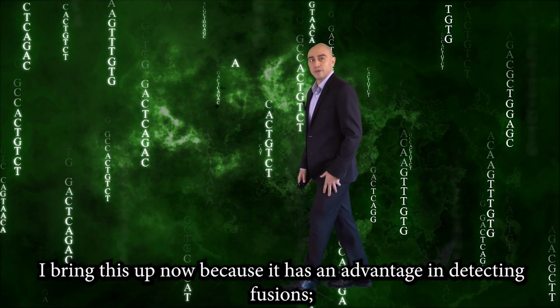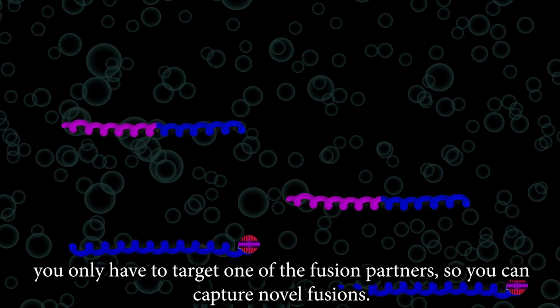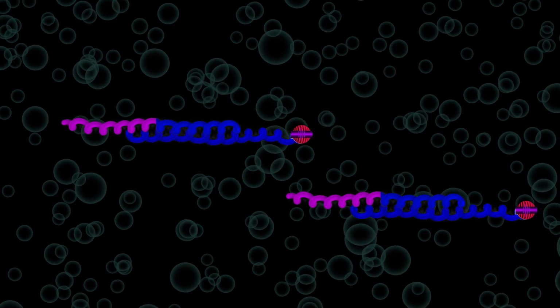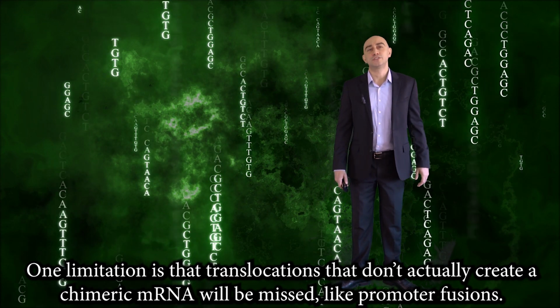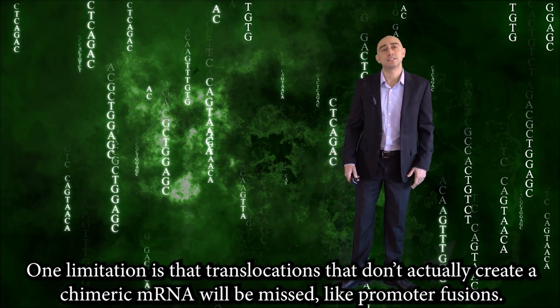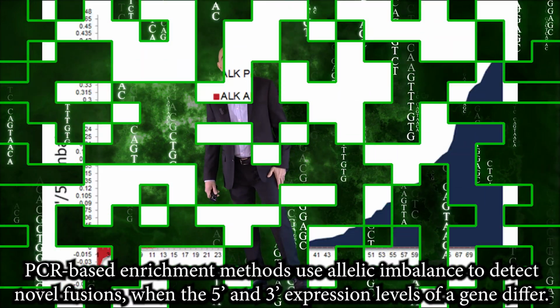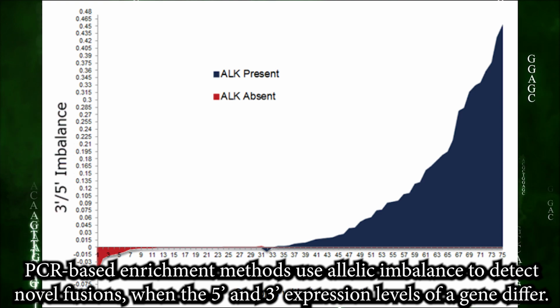I bring this up now because it has an advantage in detecting fusions. You only have to target one of the fused partners, so you can capture novel fusions. One limitation is that translocations that don't actually create a chimeric mRNA will be missed, like promoter fusions. PCR-based enrichment methods use allelic imbalance to detect novel fusions when the 5' and 3' expression levels of a gene differ.